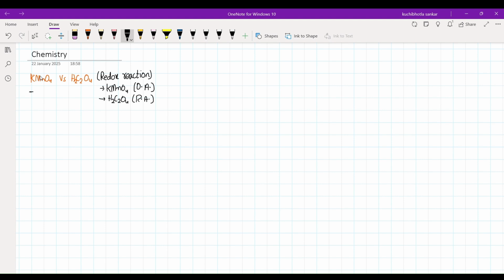Okay, the aim is over, and the apparatus is the same for almost every titration. Here you are going to use heat, along with all the apparatus, which include the burette, conical flask, pipette to remove the liquid, and you might have a measuring jar, distilled water, and a burette stand.